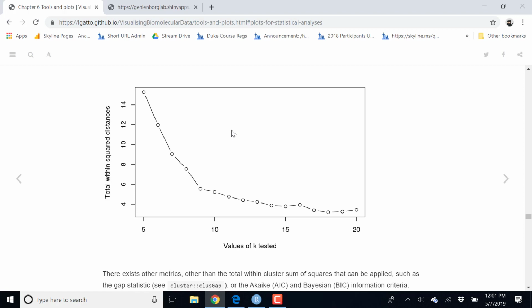And let's not forget that these clusters are very often a representation of our understanding. Right? These are quantitative data. There is no guarantee that data that contain a lot of noise will actually perfectly cluster into a certain number of clusters. We always have points that are a little bit noisy in between. But this will give us a good idea. So I have another exercise for you that will reuse.